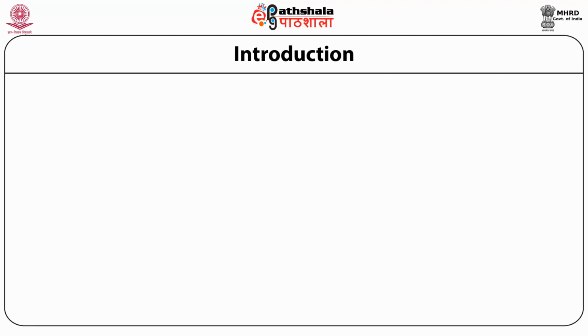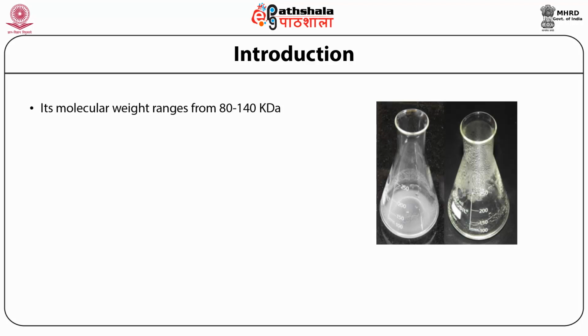In continuation to my introduction to agarose, I have to state that the molecular weight of agarose is variable and is in the range of 80 kilodalton to 140 kilodalton. Most likely, the molecular weight of agarose will be around 120 kilodalton.